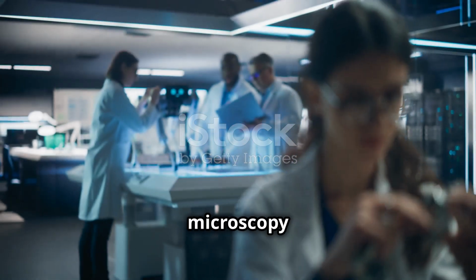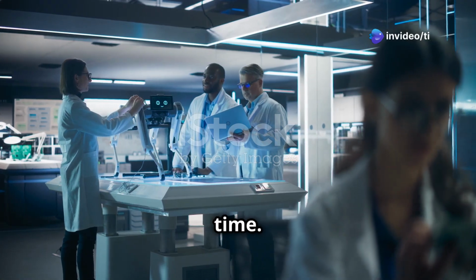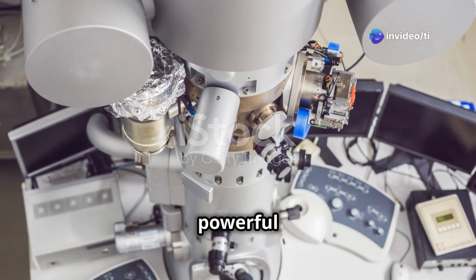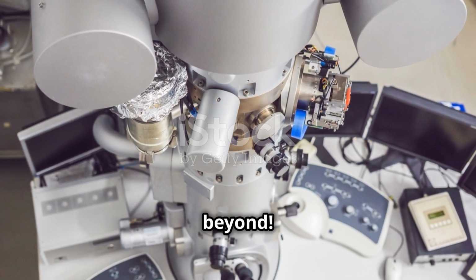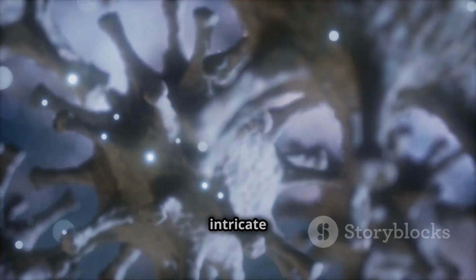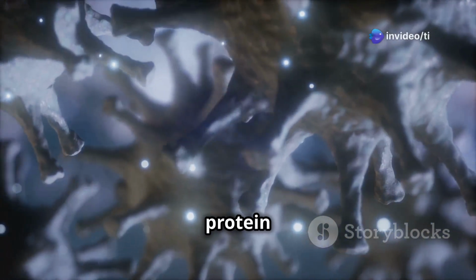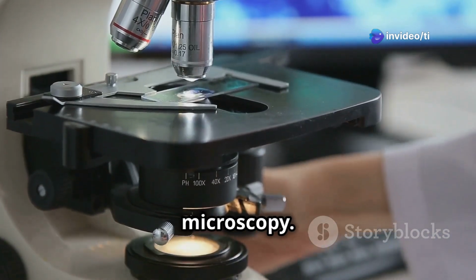The world of microscopy is constantly evolving, with new and exciting technologies emerging all the time. Scientists are developing even more powerful microscopes, capable of seeing objects at the atomic level and beyond. Imagine being able to see the individual atoms that make up a molecule, or the intricate details of a virus's protein coat. One groundbreaking advancement is the development of super-resolution microscopy.